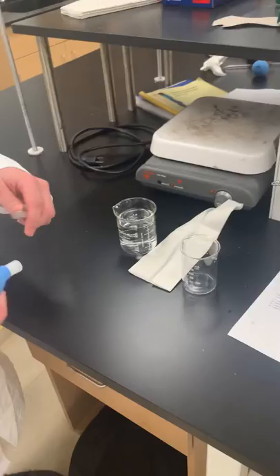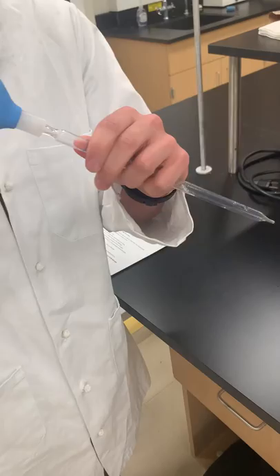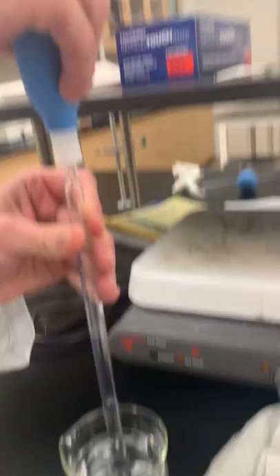So first, you're going to collapse the bulb and put it at the top of the graduated pipette. It's not going to attach — you just need to hold it there. Then insert it into the solution and draw up past where you want to draw.